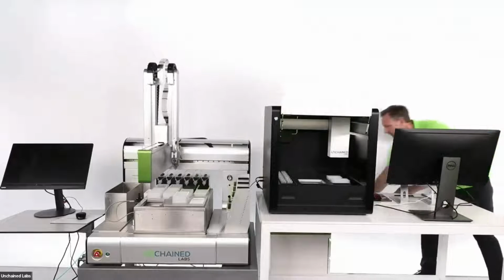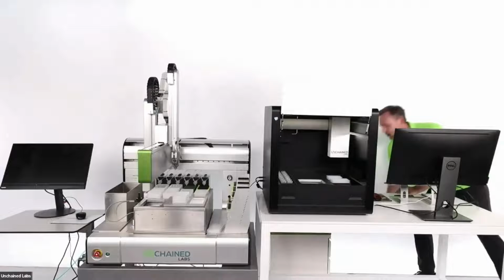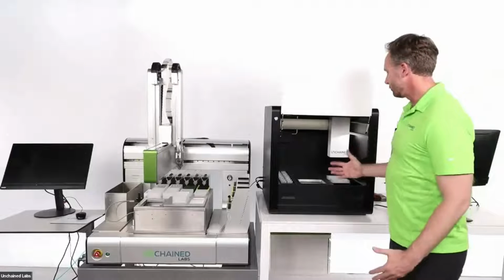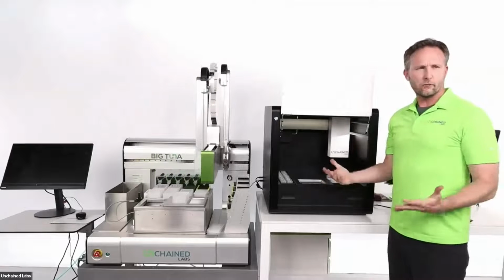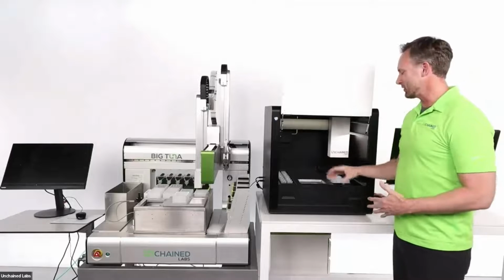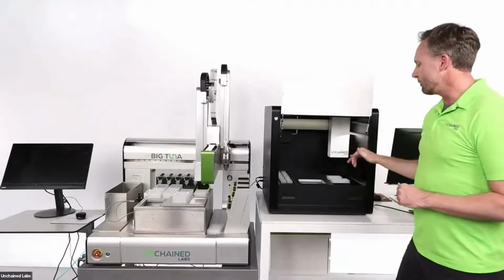And I just realized that I forgot to push, apologies, start on Unagi. So let's go over to Unagi here, switching it. Again, by this point, hopefully you're familiar with the pieces that are very similar, that buffer exchange chamber, the orbital mixer that happens, and the volume measurement.